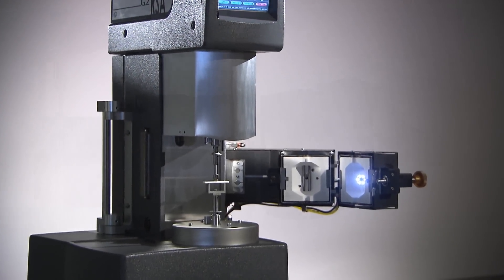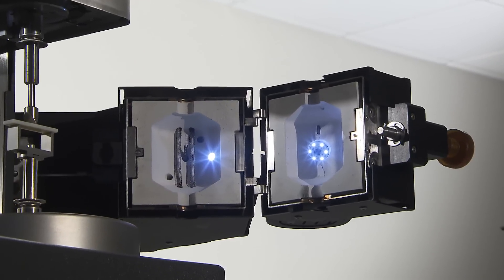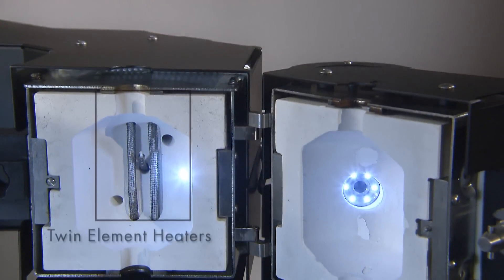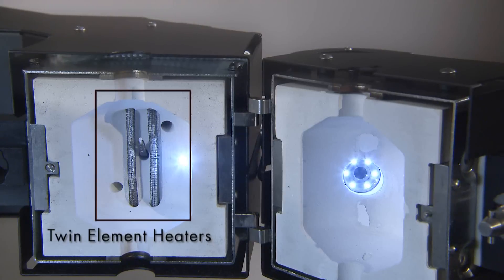RSA-G2 temperature is controlled using a high-performance forced convection oven, or FCO. Twin element heaters produce counter-rotating airflow for optimum temperature stability and extremely rapid heating and cooling over a temperature range of minus 150 to 600 degrees Celsius.